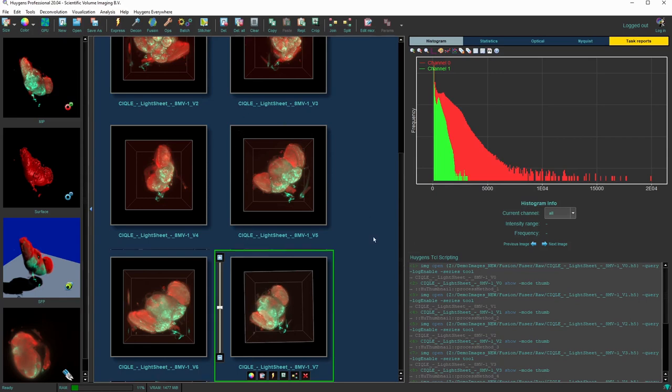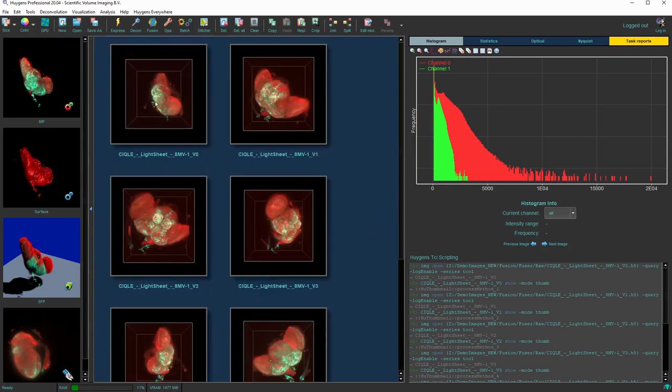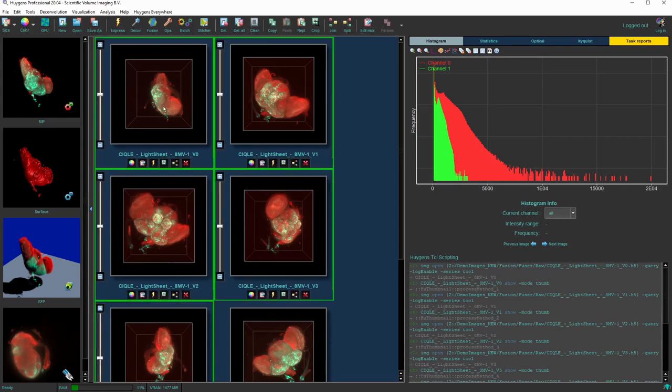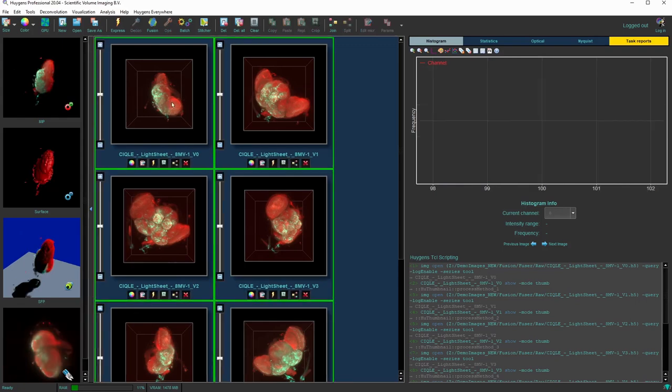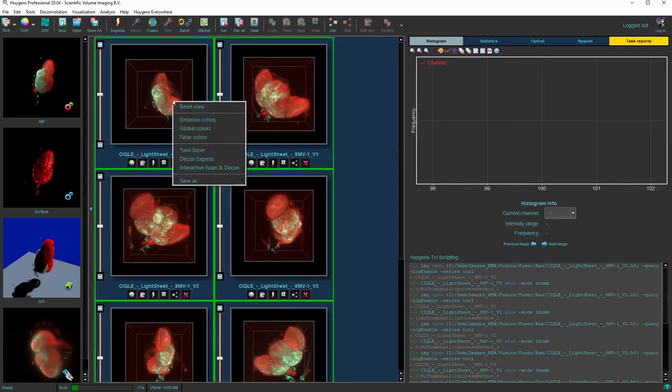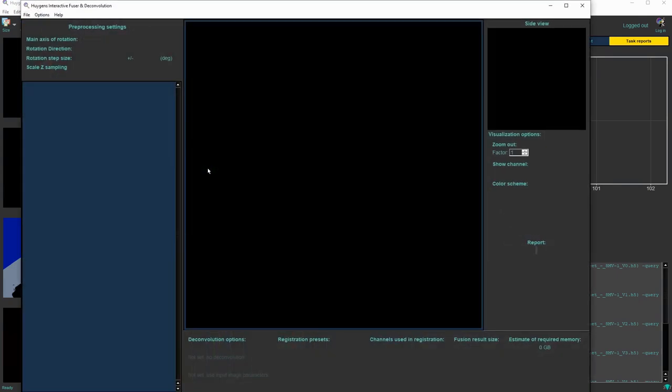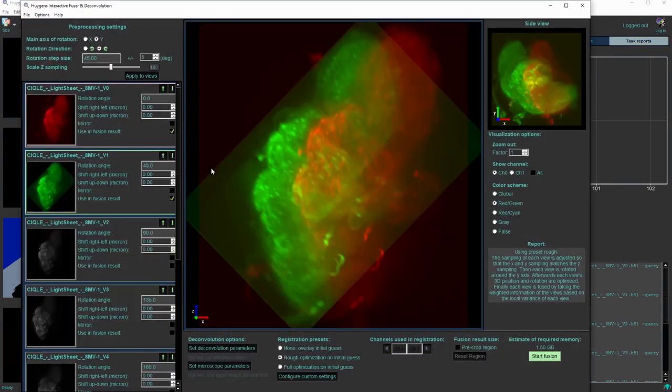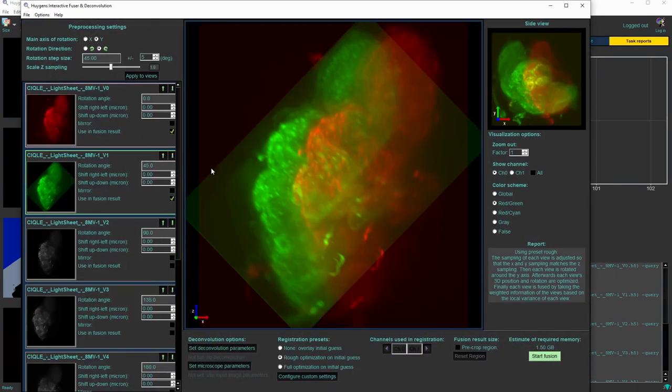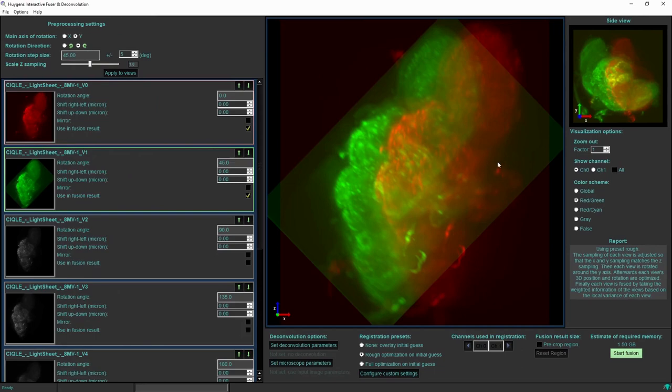We can open the tool by selecting all the thumbnails and then selecting the interactive fuser and deconvolution tool. When the window opens by default it shows all of the 8 input views on the sidebar on the left side.